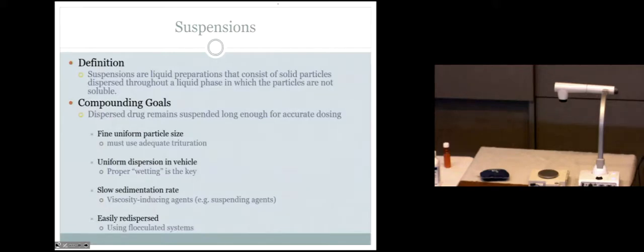It used to be before, and you guys got it easy here. We're going to be able to use these commercial products here in a minute. But in lab, not that long ago, before those were readily available, we made a 1% methyl cellulose. Were any of you desperate enough to listen to the podcast? Didn't think so. Anyway, when we talk about that, it was a real pain. It was really difficult to make, but methyl cellulose makes a really thick, viscous suspension, and that stuff, you shook it up really good, it would last for hours. But we don't need that, okay?